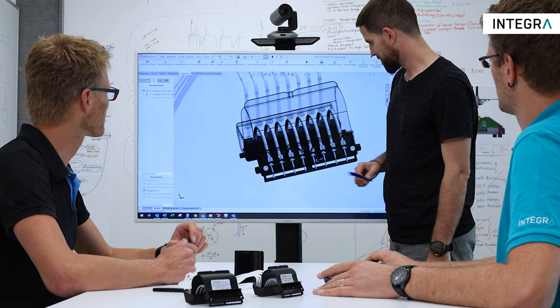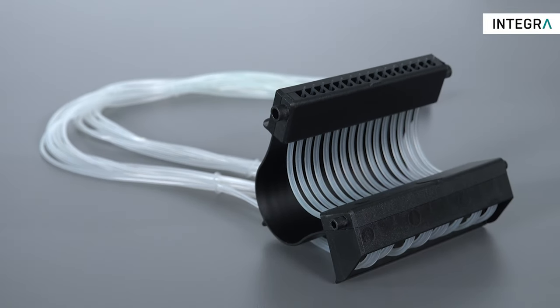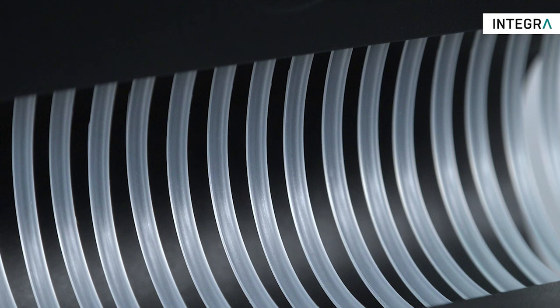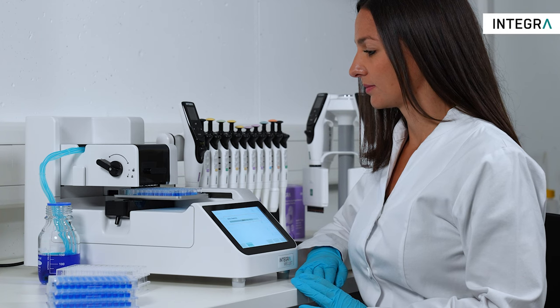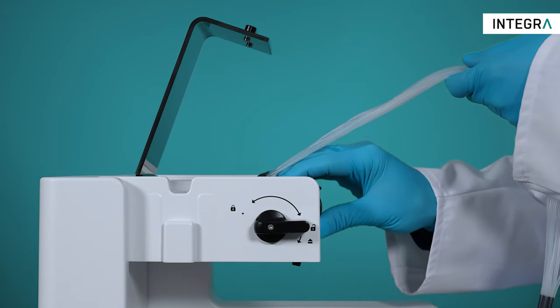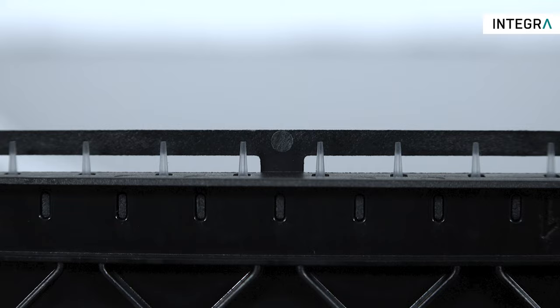At Integra, we've focused on how to minimize the running costs of your reagent dispenser while maintaining high-precision dispensing. As a result, we have developed a new type of dispensing cassette. The revolutionary EZ-Snap dispensing cassette is the first of its kind to incorporate molded silicone tubings at the interface with the pump unit, eliminating the need to calibrate or recalibrate individual tubing channels, and in turn guaranteeing customers low instrument running costs. Besides its low price tag, the EZ-Snap dispensing cassette can be easily loaded and removed from the peristaltic pump unit.